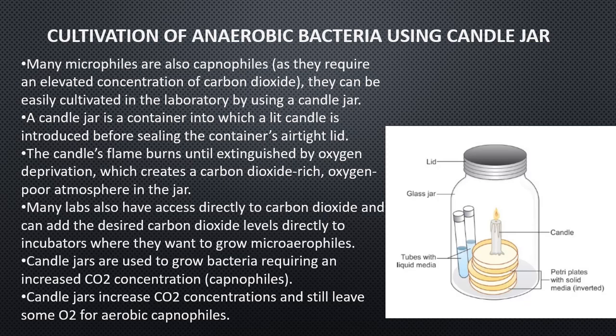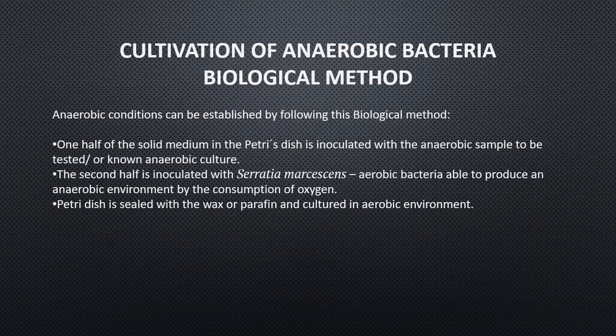You will not get rid of all the oxygen present in the jar. For example, the oxygen from the media will not be removed. So that is the oxygen which is present and it can be used up by aerobic capnophiles. So that was another one.